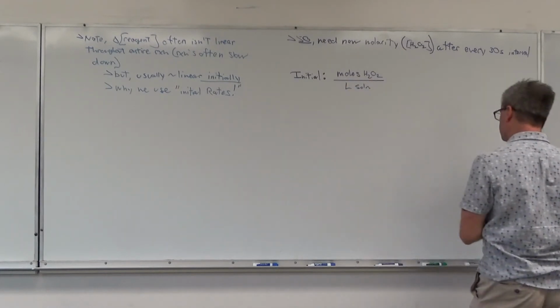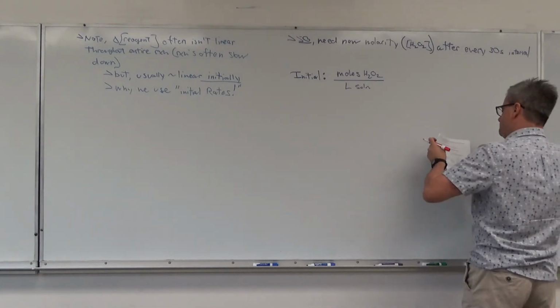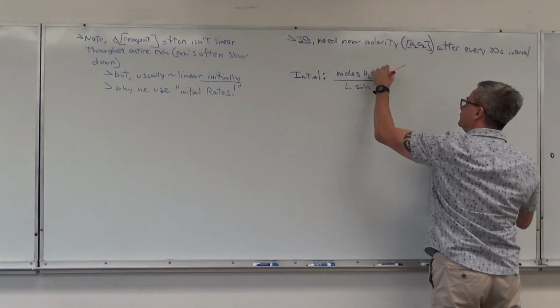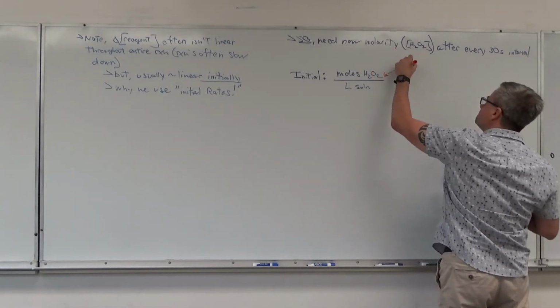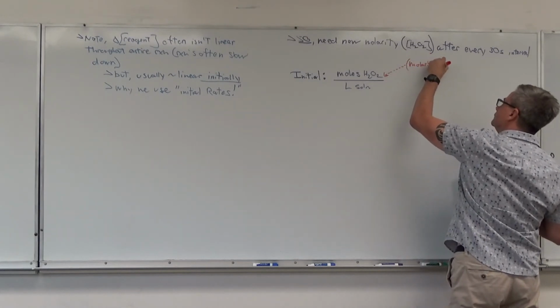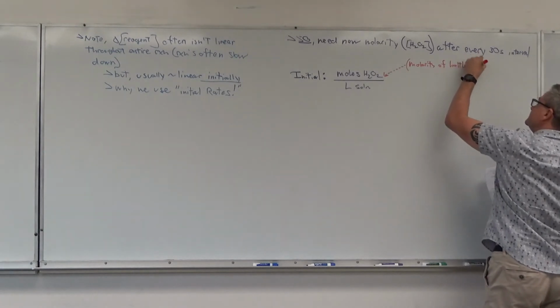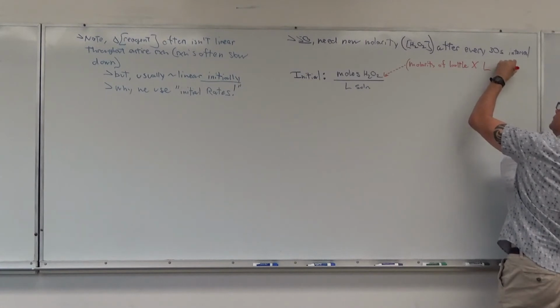Okay. Where are we going to get all those things? Okay, well, we're going to get that from the molarity of the bottle times liters used.